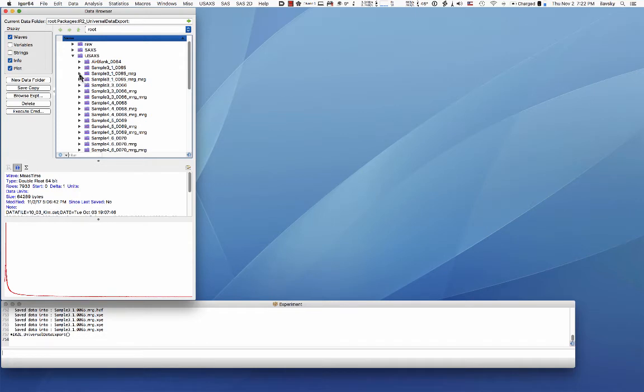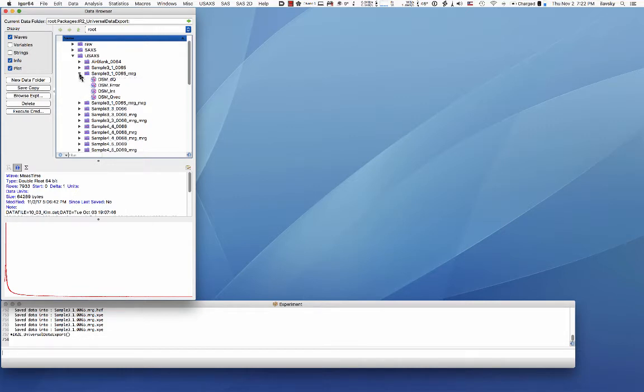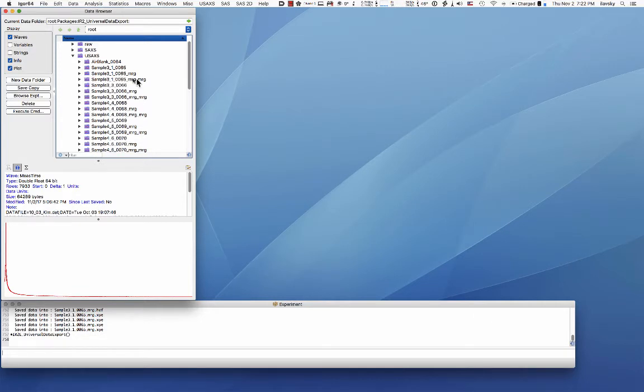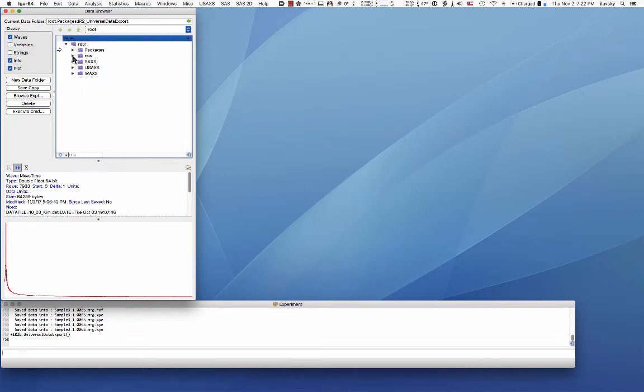Since our instrument collects data in three different segments then you can match it together with the SAXS data and then it's still USAXS type data but it's only the de-smeared data. They are longer by the SAXS segment and then you can actually attach to it a WAXS data but it's not necessary.